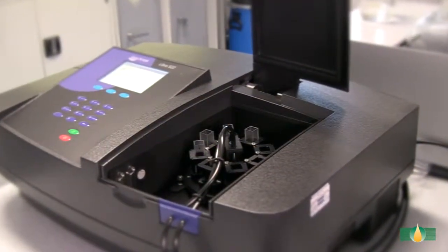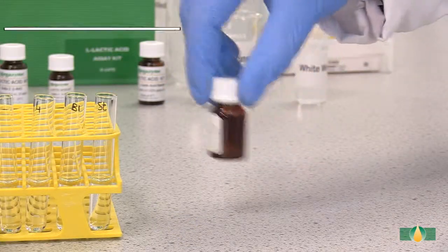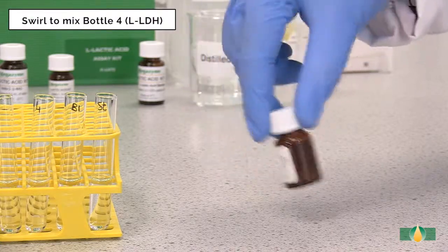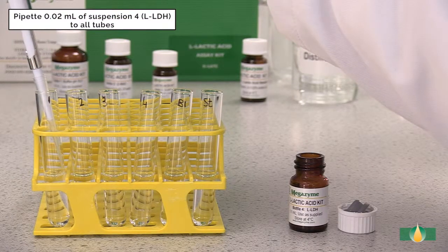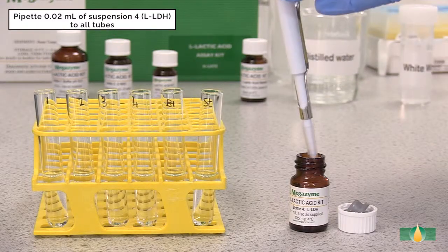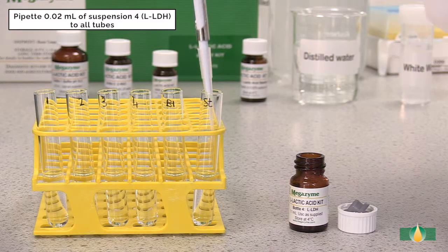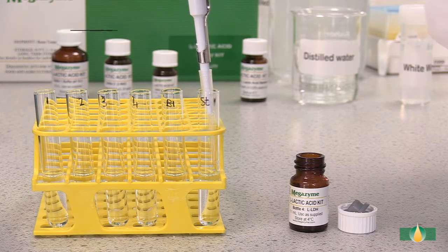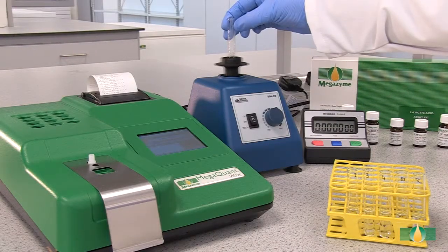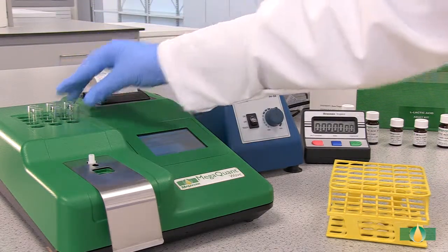Alternatively, a recording spectrophotometer with 1 cm path length cuvettes can be used. Swirl to mix the contents of bottle 4 prior to dispensing. After recording the A1 absorbance value, pipette 20 µL of the trigger enzyme L-Lactate Dehydrogenase into all assay tubes. Mix the tubes thoroughly and incubate them at 37°C for 10 minutes to allow the reaction to go to completion.